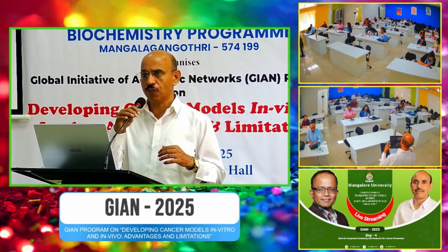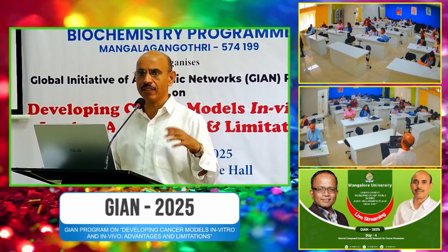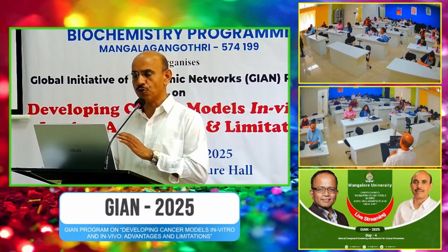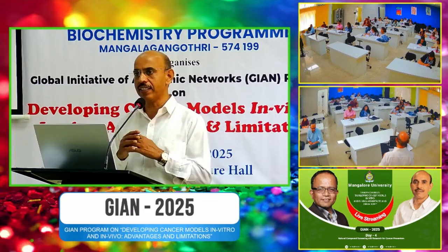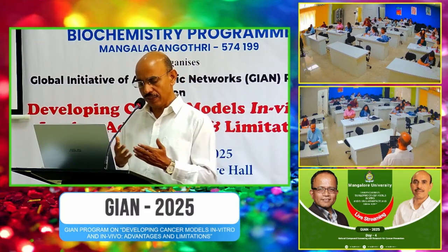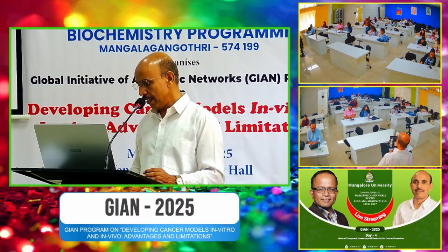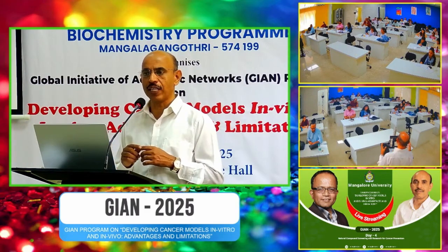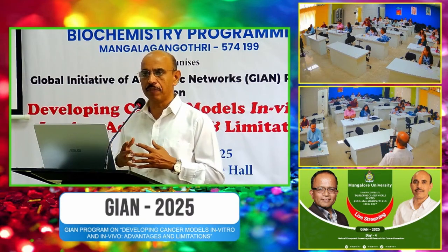Carbon dioxide incubators, earlier they used to provide the temperature, and carbon dioxide used to be supplied in that chamber. It maintains the humidified condition so that the media will not get dried. Nowadays the chambers that are available come with various adjustments, like you can sterilize the carbon dioxide incubator by increasing the temperature inside the chamber.